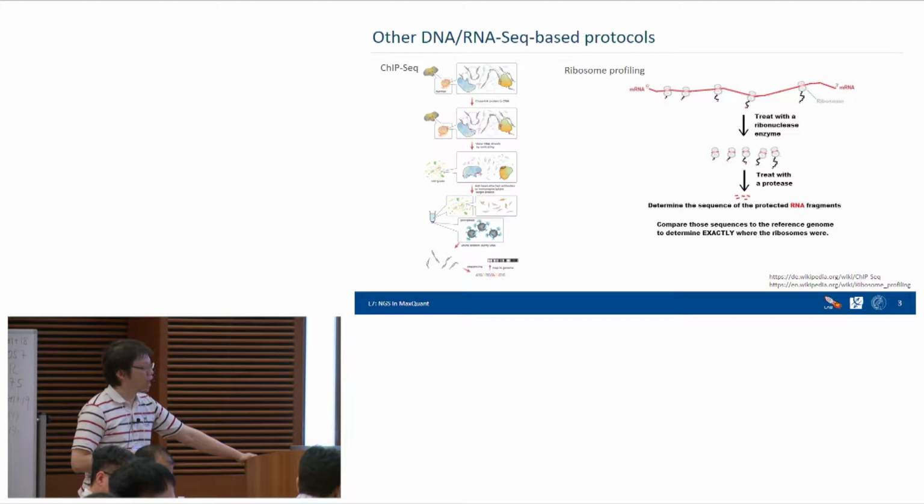And then we use an antibody to pull down all this DNA-bound protein. And then we also digest the protein. Afterward, only DNA which was actually attached to protein will be left. And then we do sequencing. So after mapping, you can imagine the region which interacts with protein will be highly enriched. So we can understand which part of the DNA interacts with our target protein.